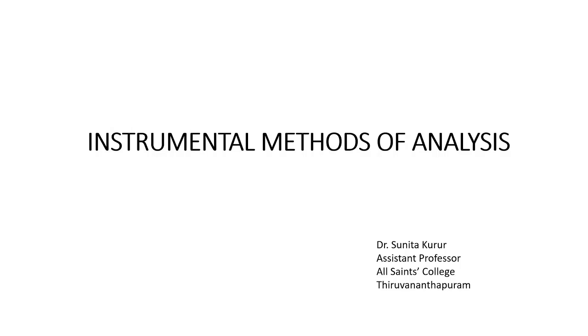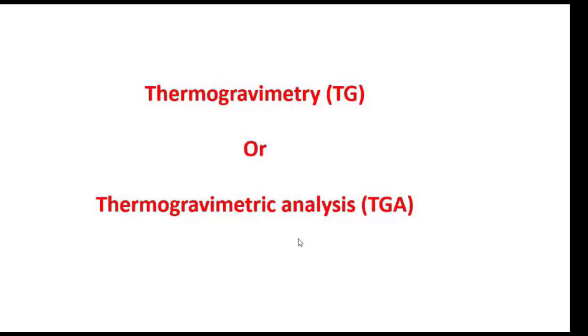Instrumental methods of analysis. In this lecture, we will learn some thermal analysis methods. First one is thermogravimetry or thermogravimetric analysis.